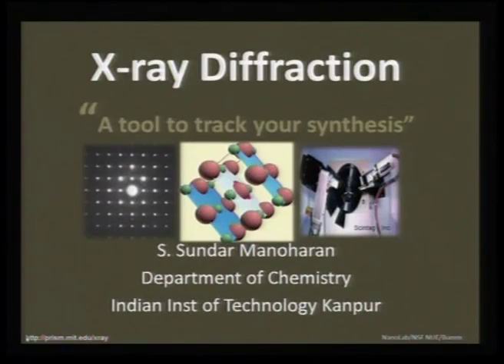In the third module, we will be discussing some very crucial characterization tools that are inevitable for materials chemistry. And materials chemistry and material synthesis is never an adventure without use of proper characterization tools. Therefore, in this module, I am going to highlight diffraction methods, microscopic methods, spectroscopic methods and thermal analysis methods which can be used as a tool to characterize materials.